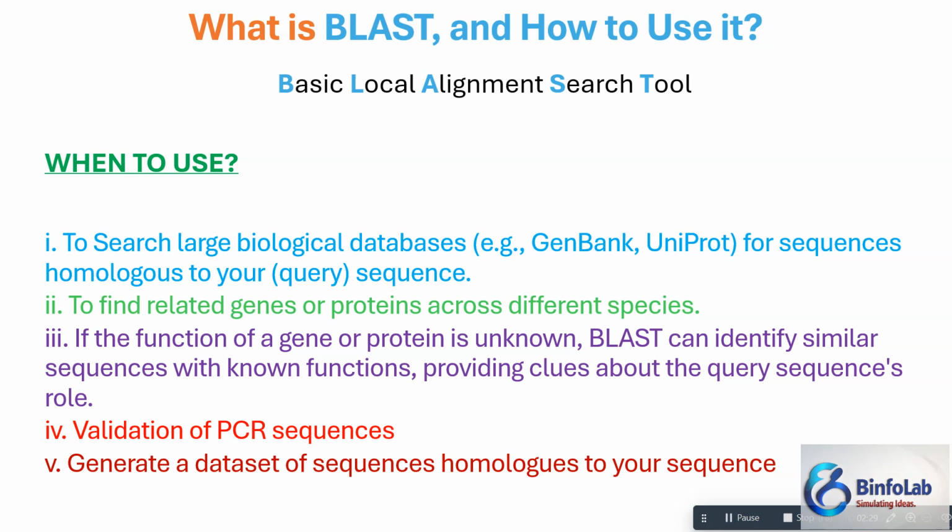What is a query sequence? The sequence which you have is called a query sequence. If you have only one sequence and you want to find out how many other sequences contain homology to your query sequence, you can use BLAST.